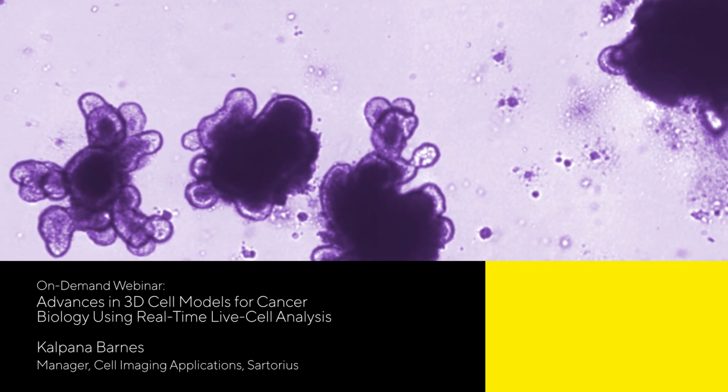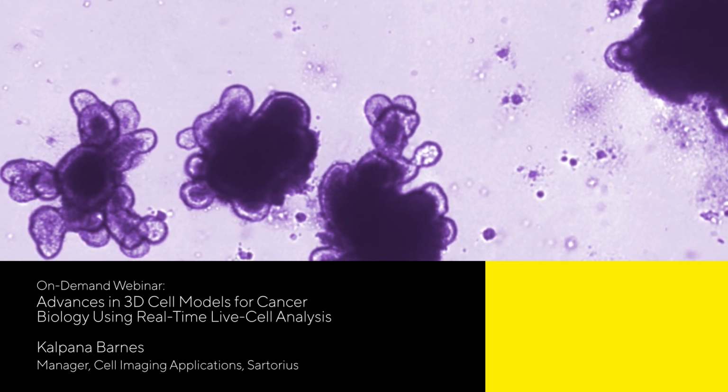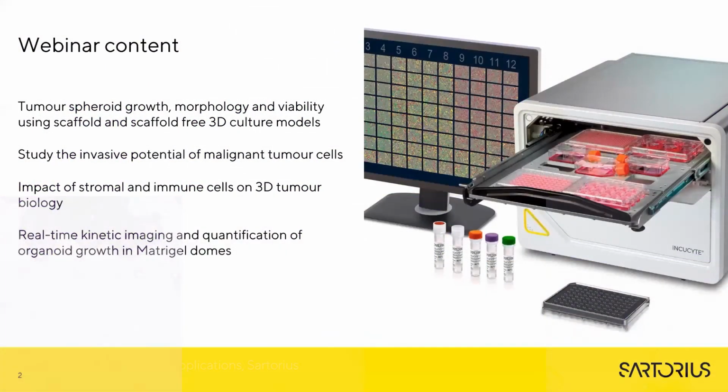The title of today's webinar is Advanced 3D Cell Models for Cancer Using Real-Time Live Cell Analysis. We know that 3D in vitro models have been used in cancer research as an intermediate model between in vitro cancer cell lines and in vivo tumours.